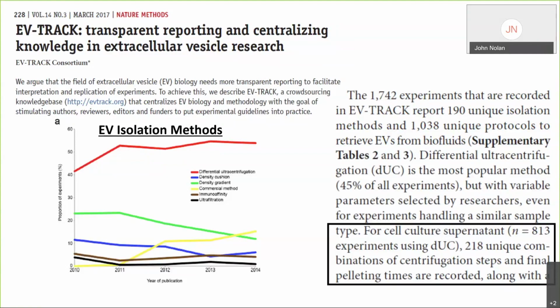And there's a lot of interesting insights in this paper, as well as some lessons. As most of you probably know, the most common approach to fractionate biofluids to enrich or isolate vesicles is ultracentrifugation. A pretty simple looking 3-step centrifugation protocol that you'll find in, it turns out, about 50% of the papers. Typically, there's a low speed spin, a higher speed spin, and then an ultracentrifuge speed spin to make some different fractions. The EV-TRACK group cataloged the reporting of those methods.